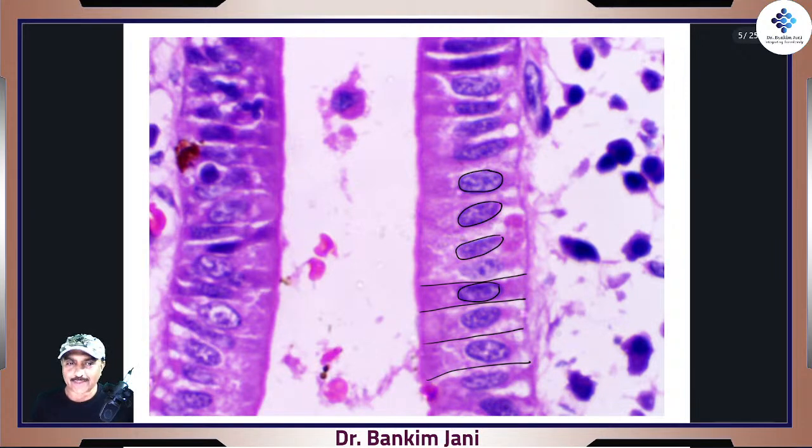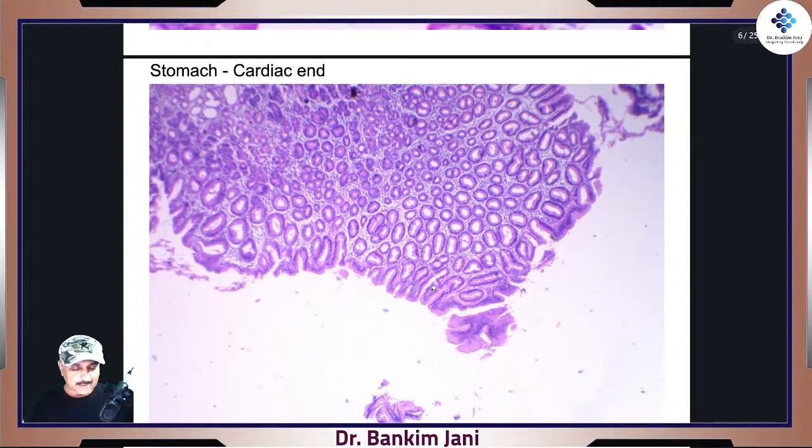These are the adipocytes towards the corner. Yes, that's right. They are the adipocytes, right? So these are the big ones, right? Let's see the stomach.